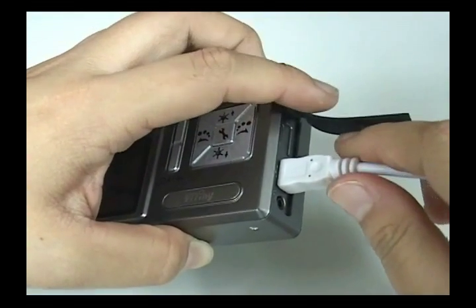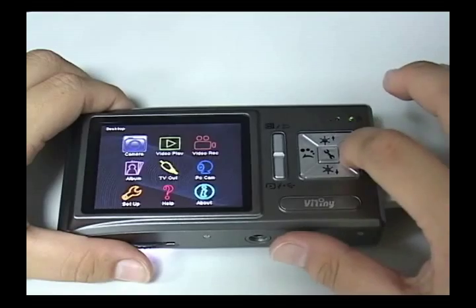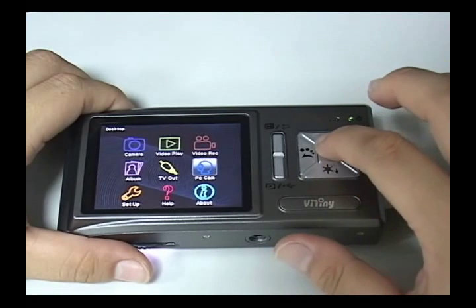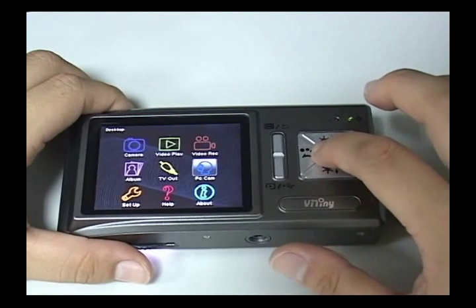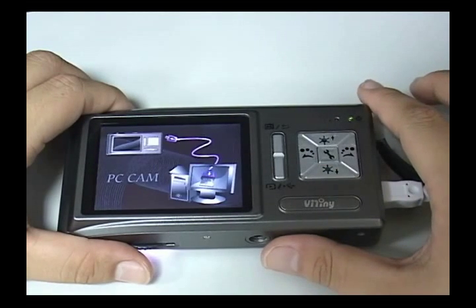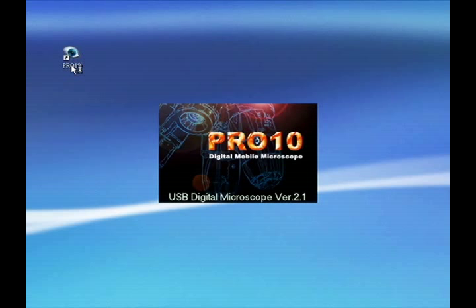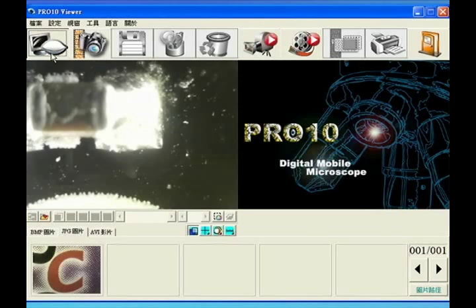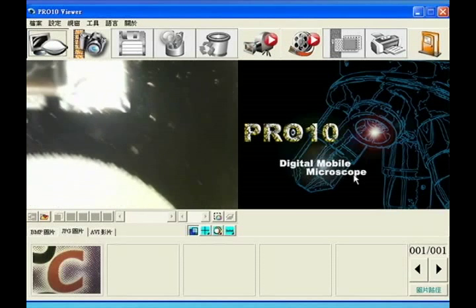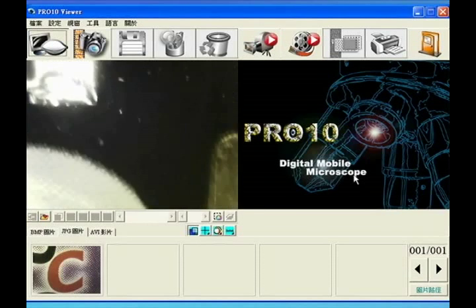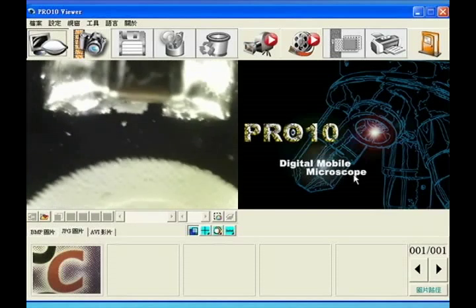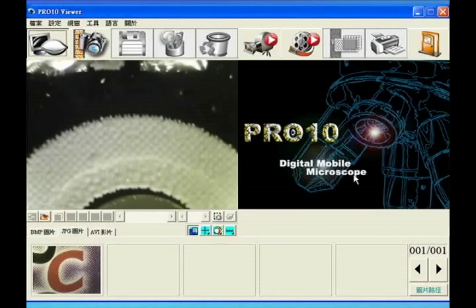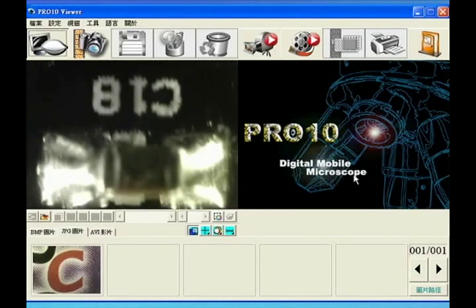Connect USB line, which enables PC Cam function. This can be used for preview and observation on the computer.